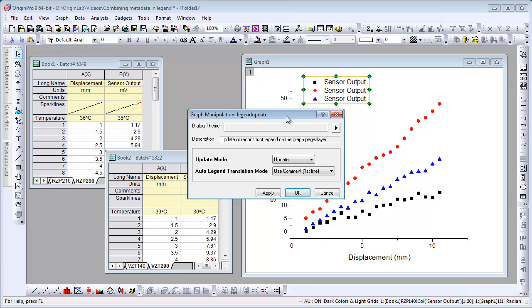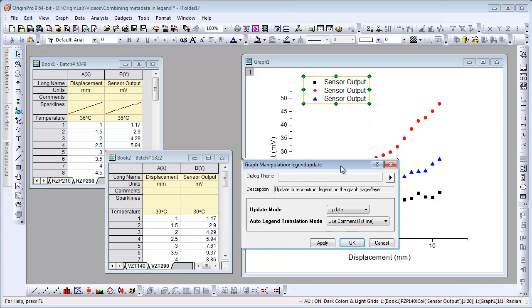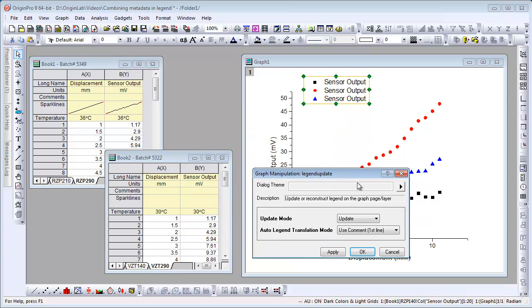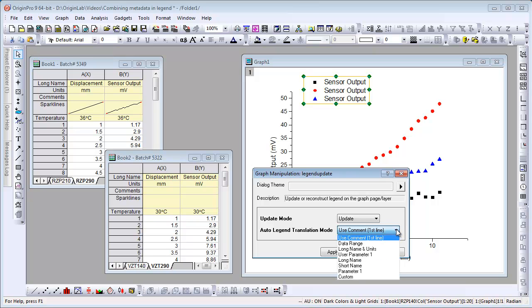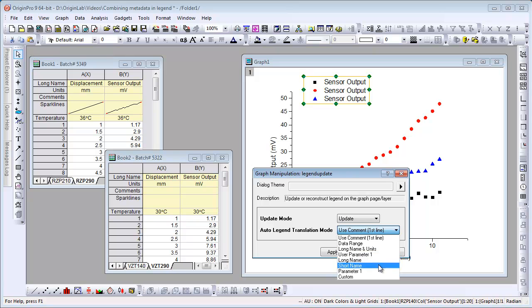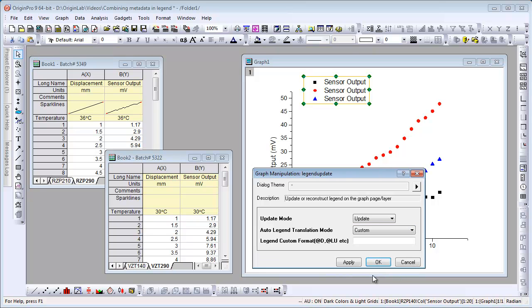This is where we can specify the legend translation mode. We could pick from the columns long name, short name, parameter, or custom.